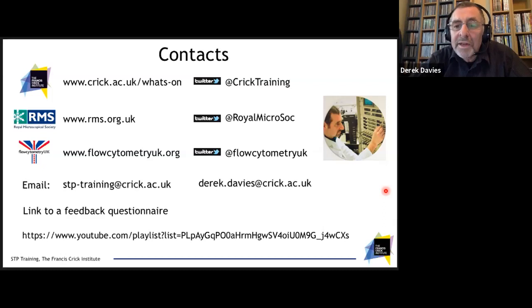It's a very good question as well. Are there any online resources that can aid in developing a panel? Well, yes, there are. I probably should have put those in a slide here as well. Many of the manufacturers of cytometers and reagents have these online. Becton Dickinson have one, certainly Thermo Fisher have one. And there are some independent resources as well, things like Chromocyte and Fluorofinder. These are a good starting point because you can type in your particular cytometer, so the configuration, the number of lasers, the number of detectors. So if you choose a wrong fluorochrome, it will say, sorry, you can't measure it on this cytometer. They're also linked to many of the manufacturers' reagent catalogs.